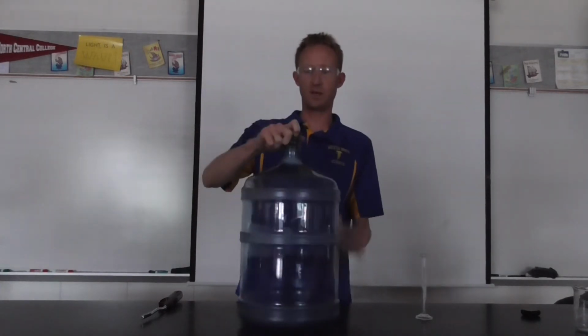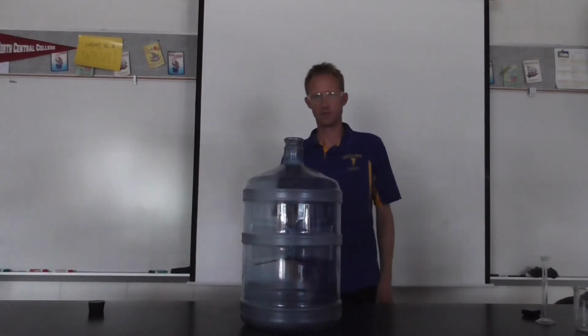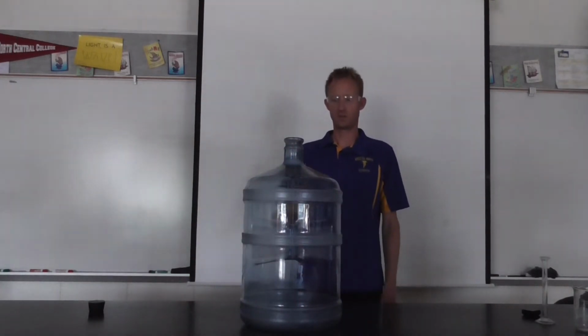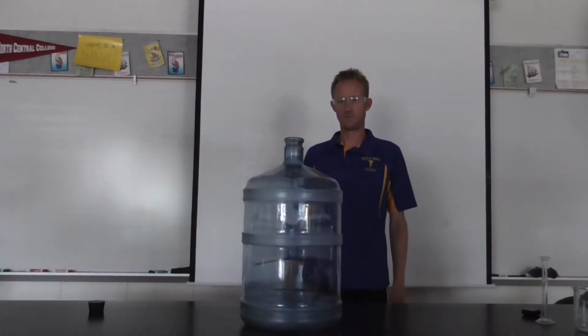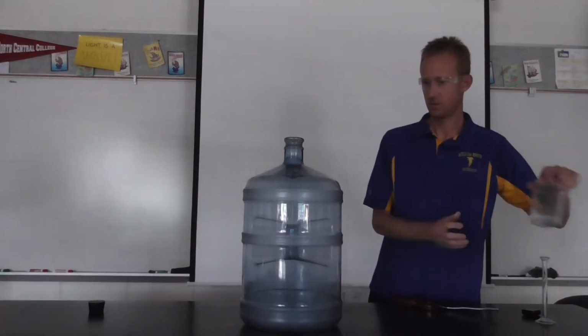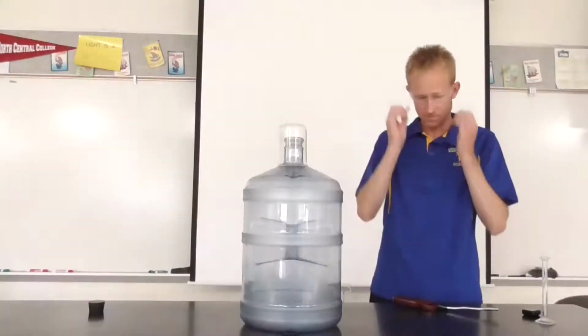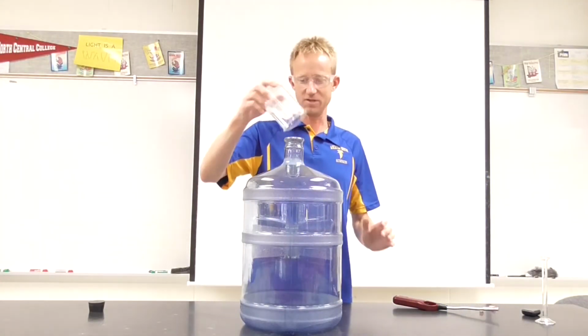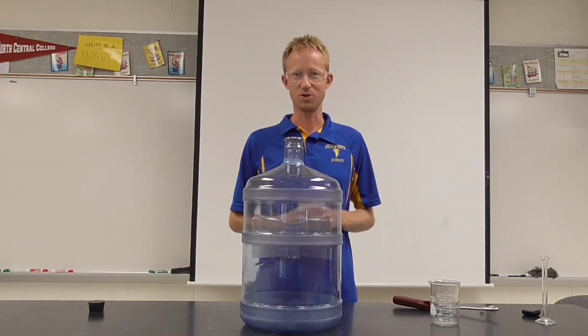All right, are we ready? Here's some methanol combustion. Now this is always a student favorite, so as long as we have all the materials, maybe we should try one more time.